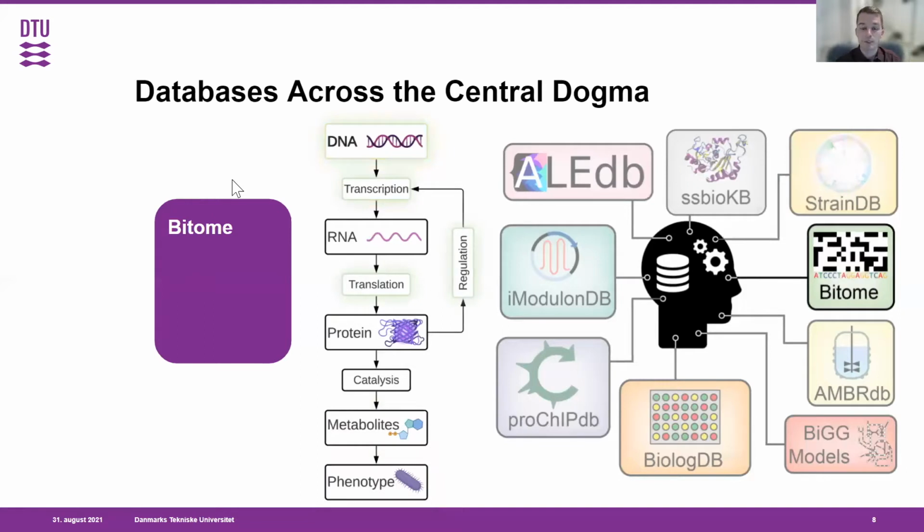Next up is the bitome. Now, this is a pretty unique and interesting DNA database where it's basically a giant table where each of the millions of columns is a single base pair of DNA, so a single letter moving down the genome. And then each row is a separate bit of information about that specific location on the genome.